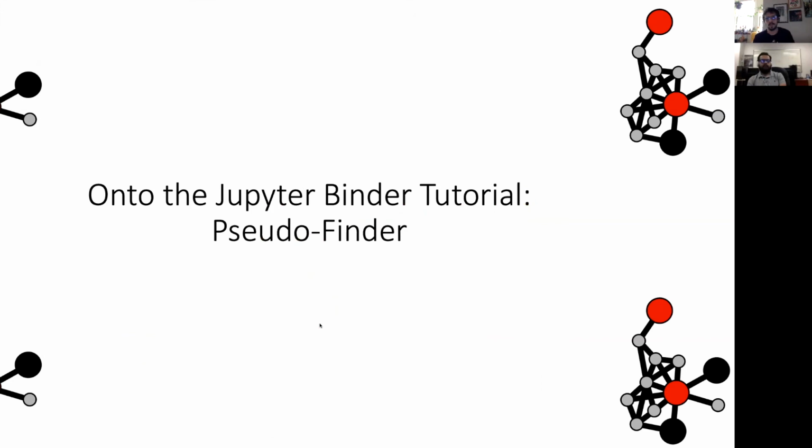Okay, all right. So we're going to move on to the Jupyter Binder tutorial.